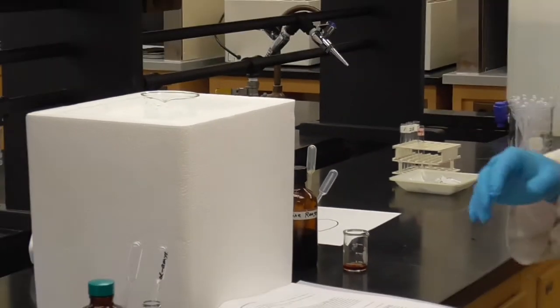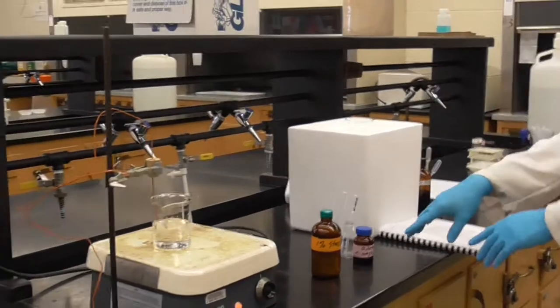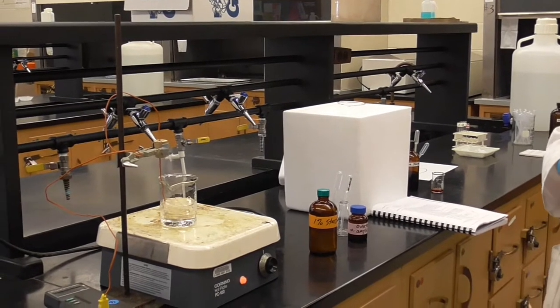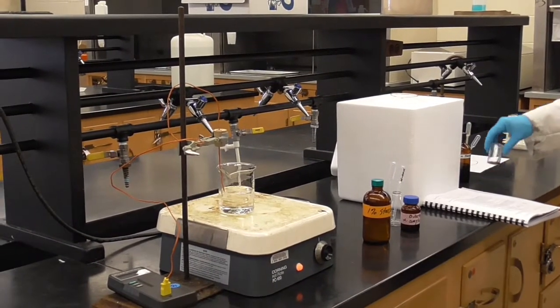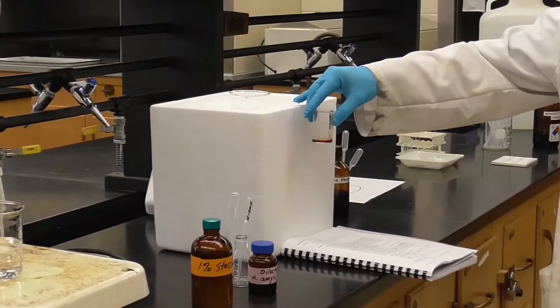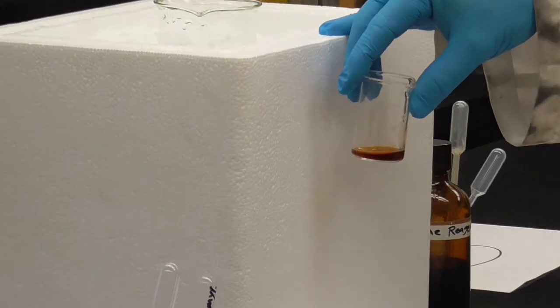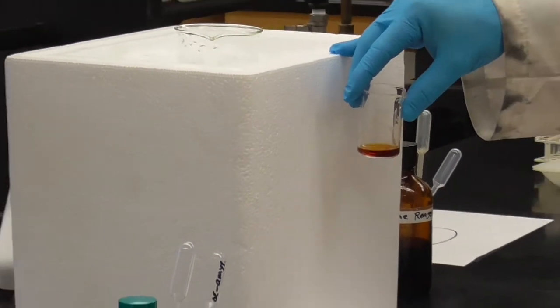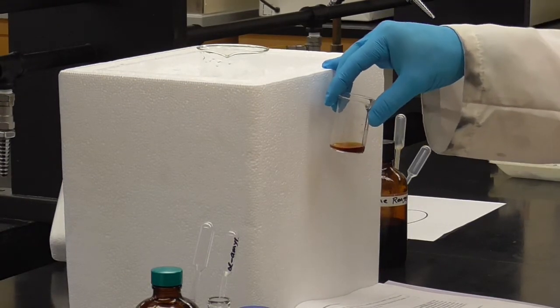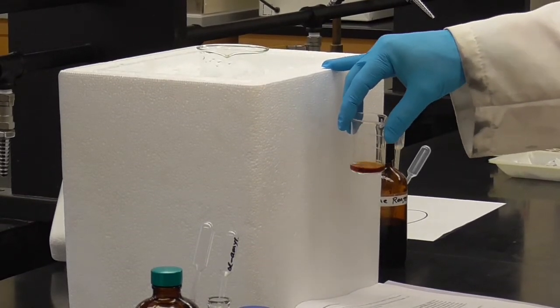All right, so we have all of our solutions present and ready to go. Now, when we add the indicator to the starch, to see if it's there or not, to see the activity of the enzyme, we'll get different colors. Again, if there is no starch present, then you're going to get that color, or maybe a lighter version of it, so you get kind of a goldish color. That would indicate that the enzyme was working very well, right? That we broke down all that starch, there's no more left. So that would indicate a very high level of enzyme activity, and we'll call that a number 3. When you're taking your data, that would represent a number 3, a gold color, high activity of the enzyme. Boy, that enzyme is really working.